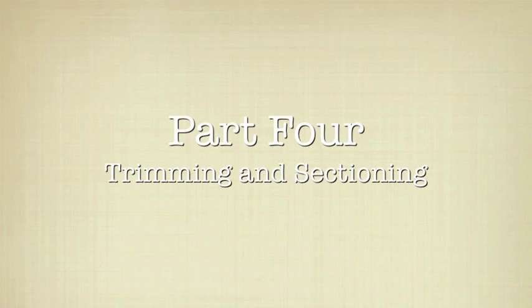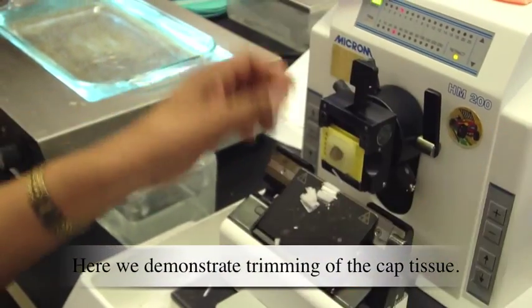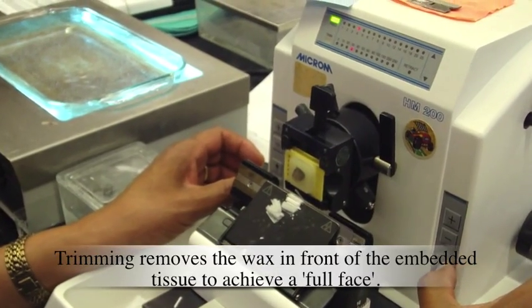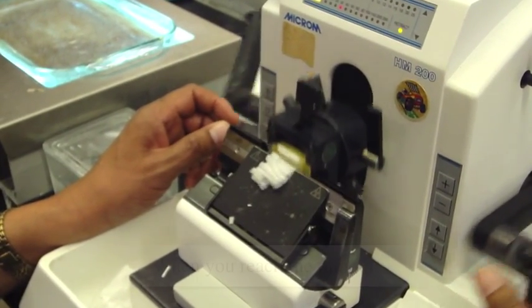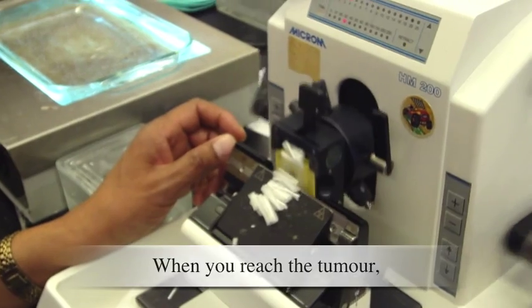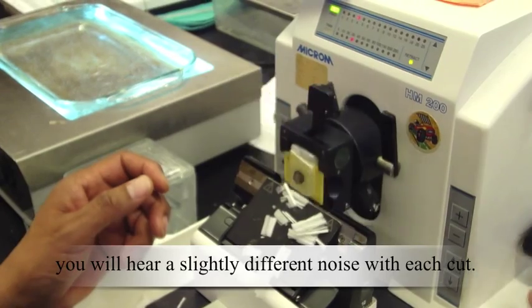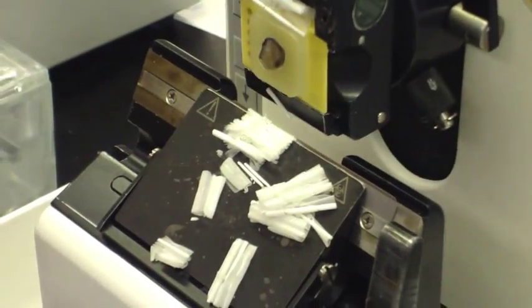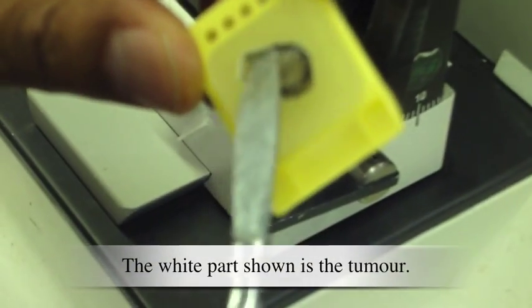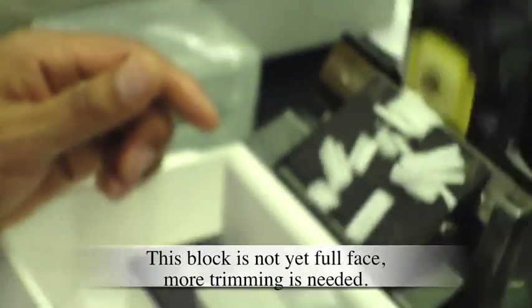Part 4: Trimming and Sectioning. Here we demonstrate trimming of the capped tissue. Trimming removes the wax in front of the embedded tissue to achieve a full face. When you reach the tumor, you will hear a slightly different noise with each cut. The white part shown is the tumor. This block is not yet full face — more trimming is needed.